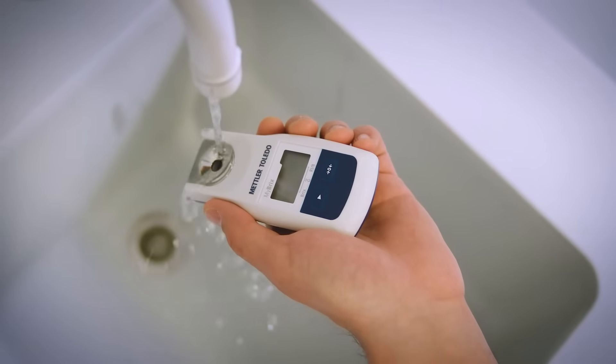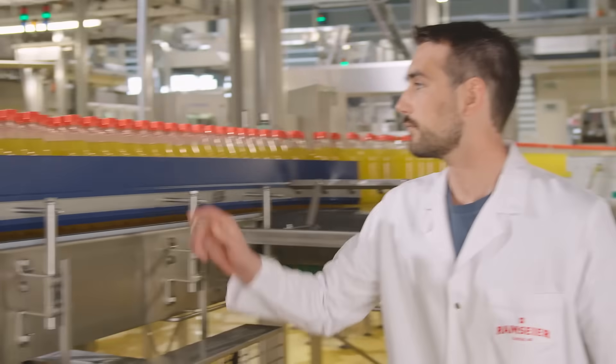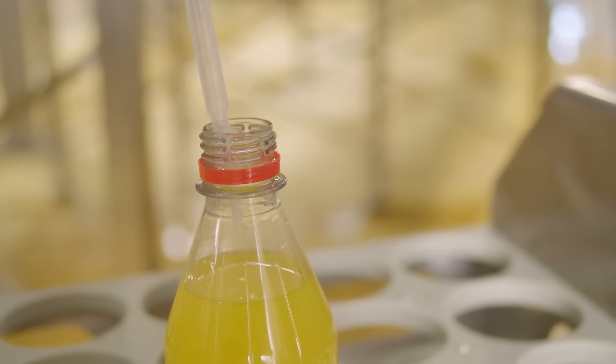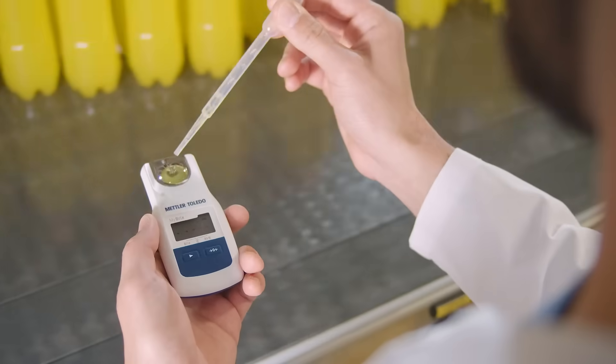Easily clean the prism dish to move on with another sample. Benefit from a waterproof and robust design.